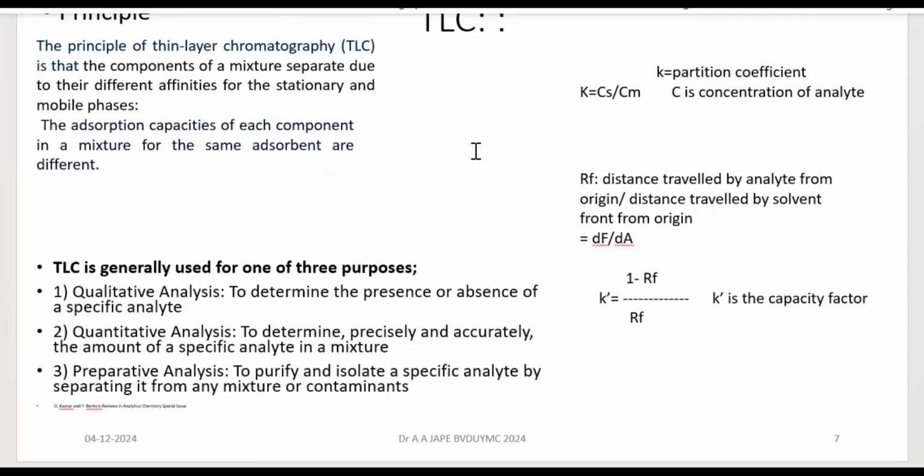And the third purpose is preparative analysis, where purification is the aim. So from the mixture, the analyte is to be isolated and purified. And this is how you have three different purposes for which TLC works.